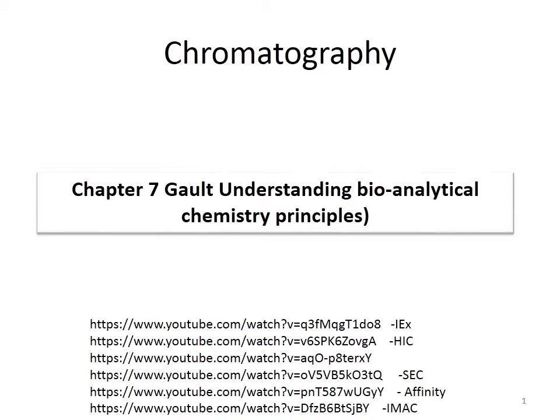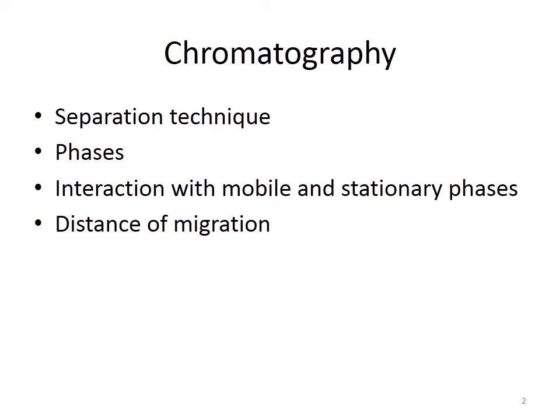In this session, we are going to see about the process of chromatography for separation of molecules. Chromatography is a separation technique which is based upon the separation of molecules on their interaction with the mobile and the stationary phase. In the technique of chromatography, there is a stationary phase and a mobile phase. The mobile phase could be a liquid or a gas. The molecules which are to be separated interact with both the stationary and the mobile phase.